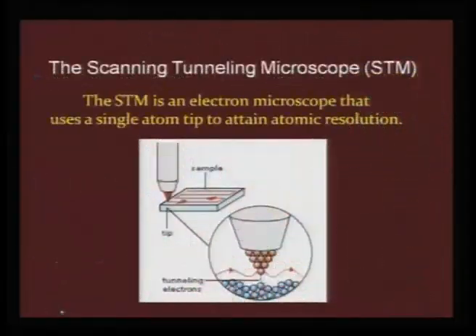So, we will look at the principle of STM. In this slide, I am just giving you a brief outline of what this technique is. It looks simple from this diagram, but it can become the most complicated technique in terms of attaining the tunneling condition. What you see here is a tip, and this tip is made to scan in the XY direction, and when you scan in the XY direction, you should be able to map the atomic level arrangements.